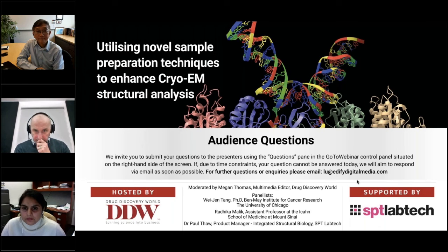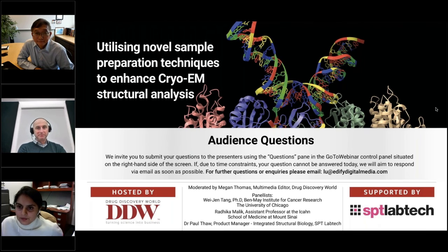One very generic question. What processing software was used, Relion or CryoSPARC? We use mostly Relion. I used both, and I was getting very similar results from both. So I mean, they were pretty much the same. I think there's no right or wrong answer there, to be honest.